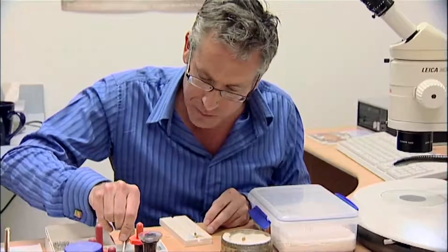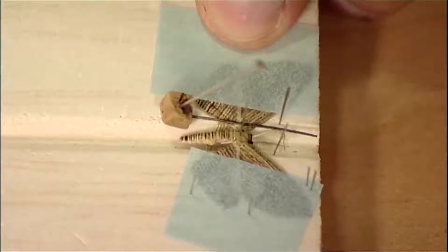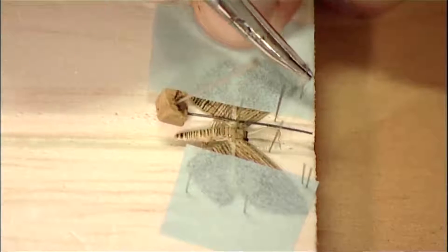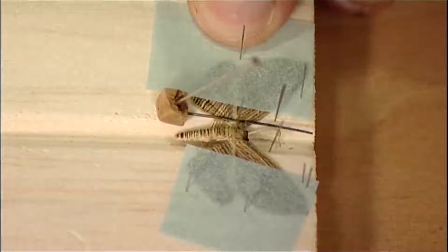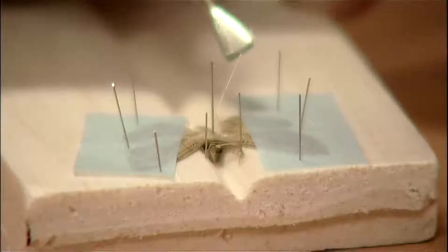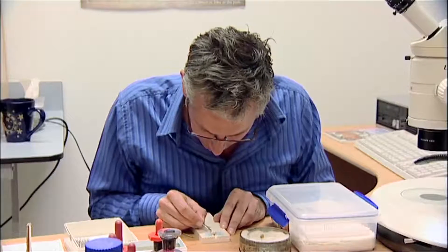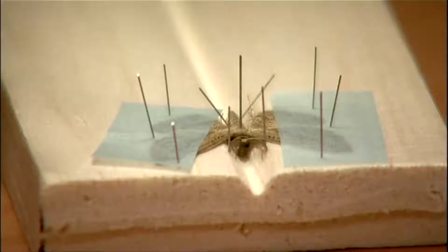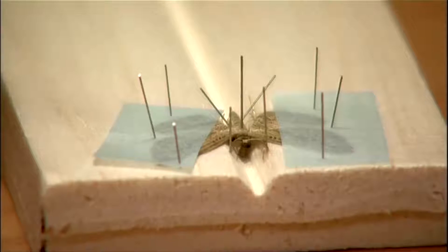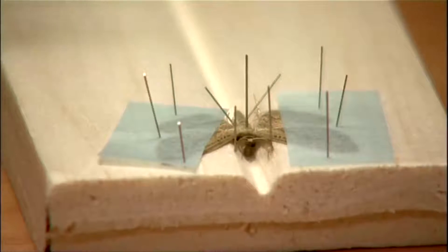And you do exactly the same on the other side. The important thing is to make it look nice and symmetrical. The last thing I usually do is just arrange the hind legs nicely to either side of the abdomen, and put a couple of pins underneath the abdomen so that the body is nice and level. Now you'll leave it like that to dry for at least two to three weeks, and then you can take it off, put a label on it, and put it in your collection.